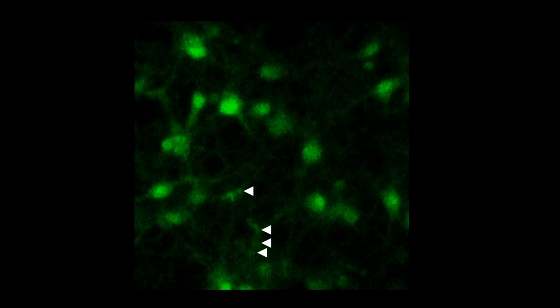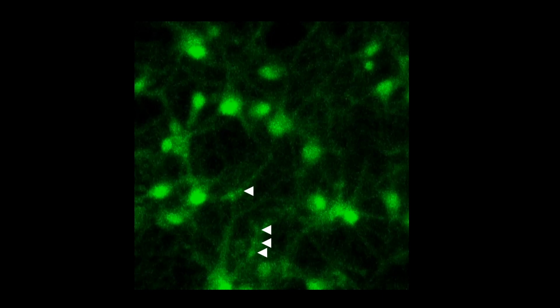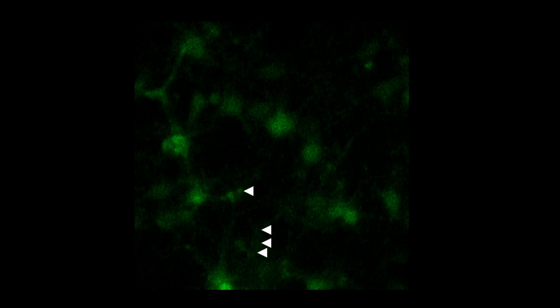When the neurons are stimulated, you can see fluctuations in the brightness of the dye as the calcium enters the synapses to trigger neurotransmitter release. I've labelled some of the synapses with white arrowheads to help you identify them. As you can see, there's a lot of information here with the connected neurons behaving like a network.